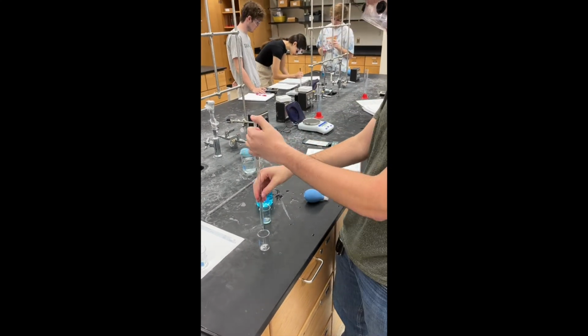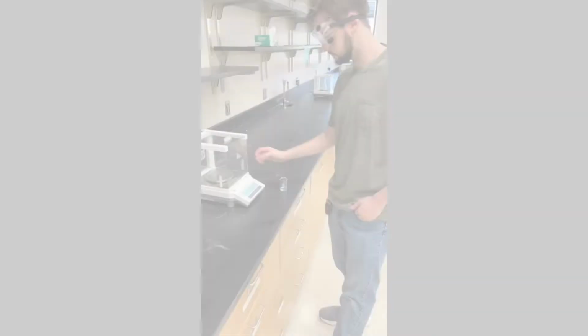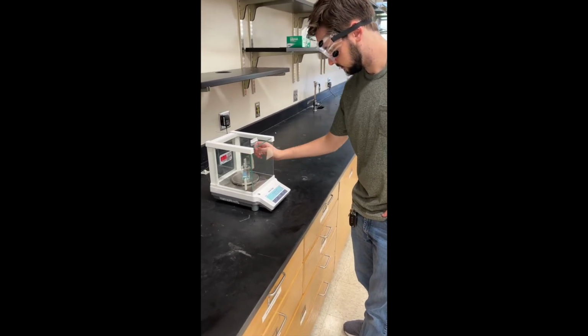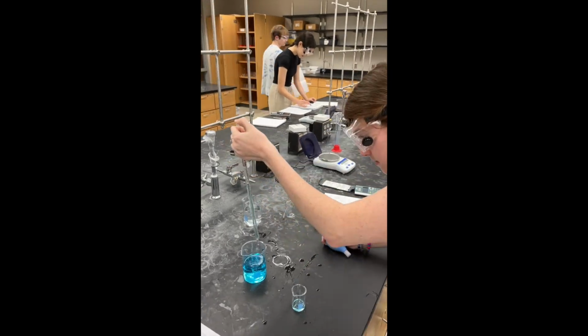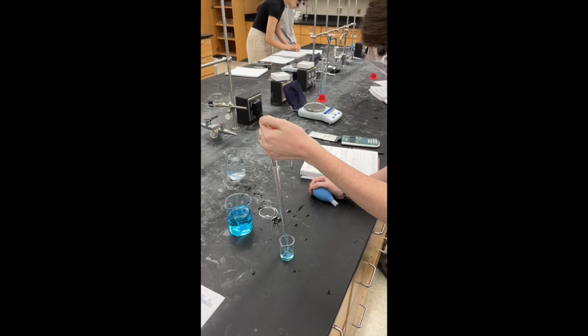Before the experiment began, the mass of each beaker used was measured. The mass of each concentration was taken at 5 milliliters, and then the mass of the beaker was subtracted from the overall mass of the beaker and solution. The resulting difference in mass was used to calculate the density, or mass divided by volume, of each sugar solution. The resulting density was used to plot the graph shown in the results section of this video.